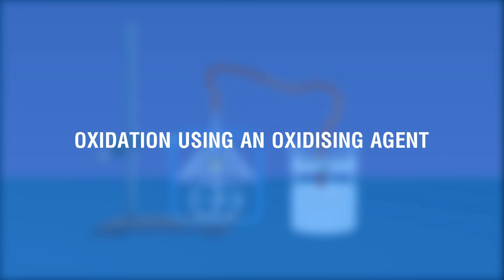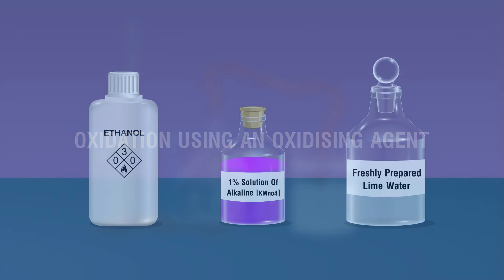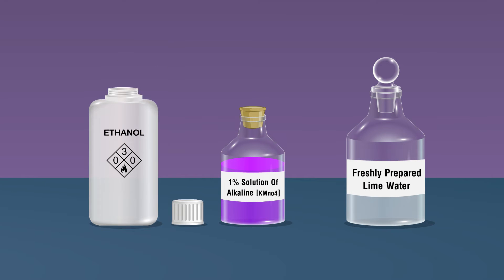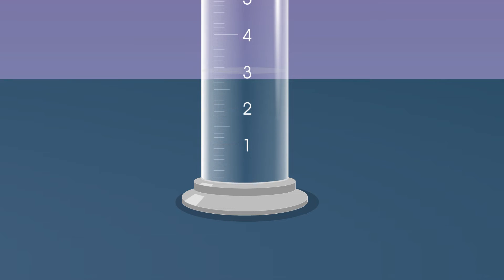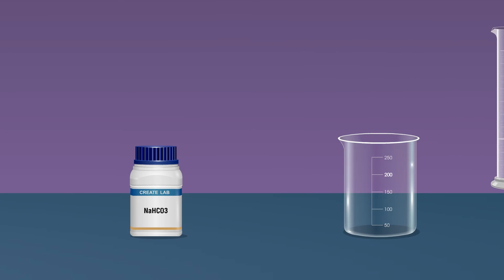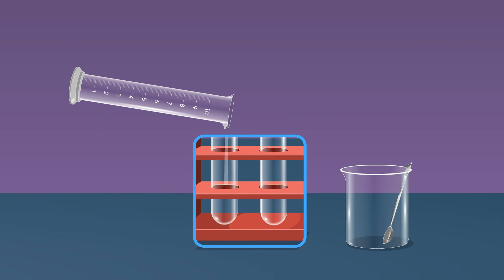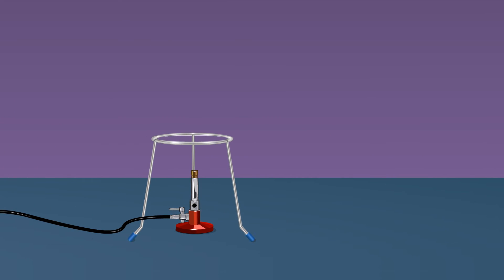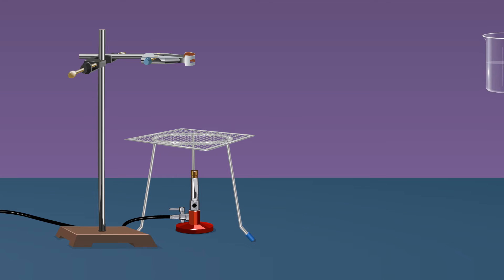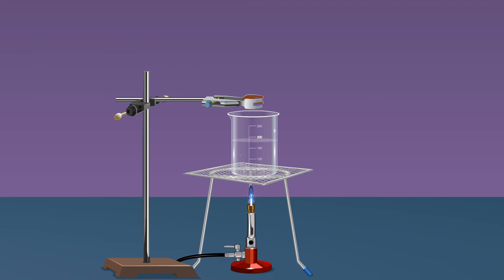Oxidation using an oxidizing agent: Take 3 ml of ethanol in a boiling tube using a measuring cylinder. Place the tripod over the burner, put the wire gauze over the tripod, place a stand close to the tripod, put a beaker containing water above the wire gauze. Clamp the boiling tube and place it into the beaker.